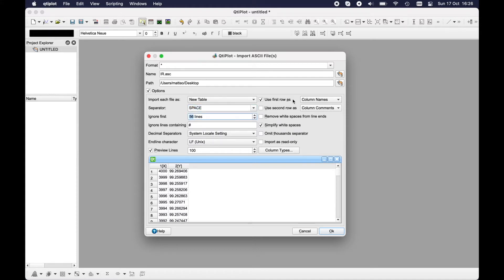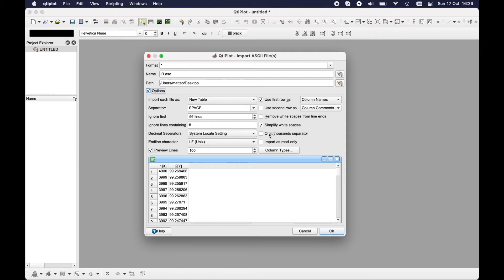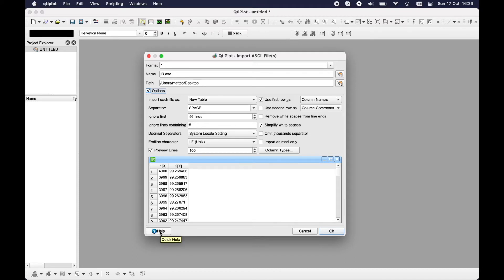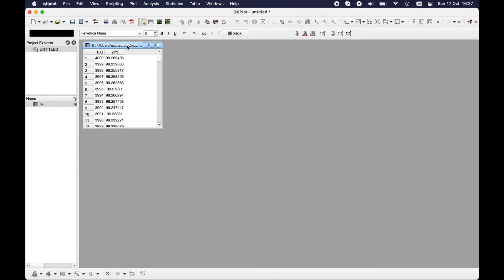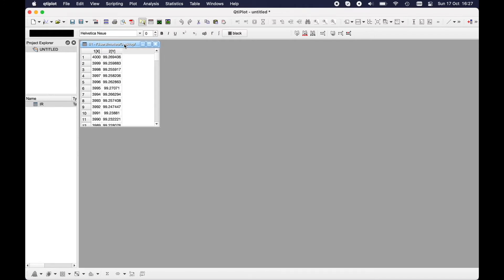Here you can decide to use the first row as column names, the second as column comments, and so on. You can omit thousand separator if any. Here you have some options to play with. You can see the quick help by looking at the handbook. If you have more than one file, just import it and click OK to import every file. So you click OK and you import the file.